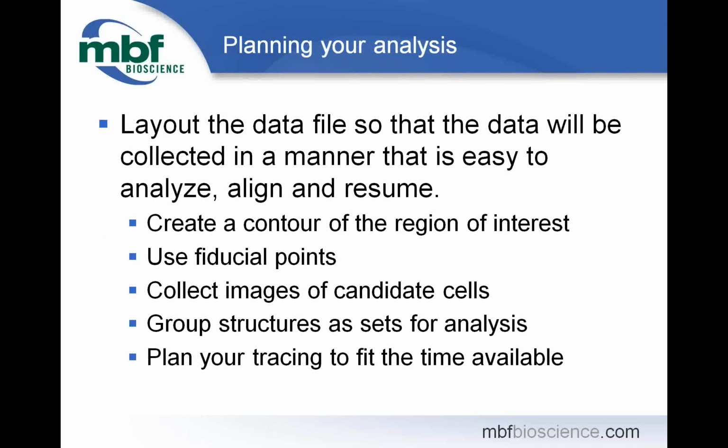Okay, so you'll want to lay out your data file so that the data will be collected in a manner that's easy to analyze, align, and resume. You can create a contour of your region of interest. So if you're analyzing cells within the cortex, which is what we're going to be doing today, you can trace a contour that bounds the entire cortex for that section so that you have a reference for where that cell was inside your region of interest. Using fiducial points when you're tracing your contour will help with alignment later on.